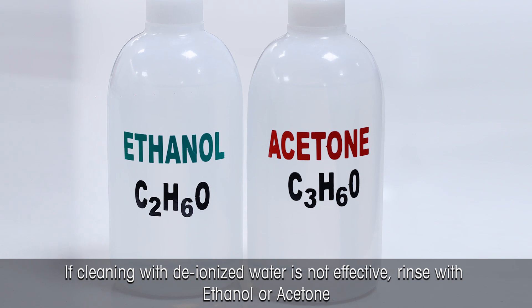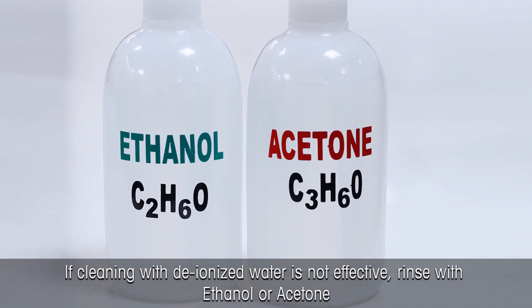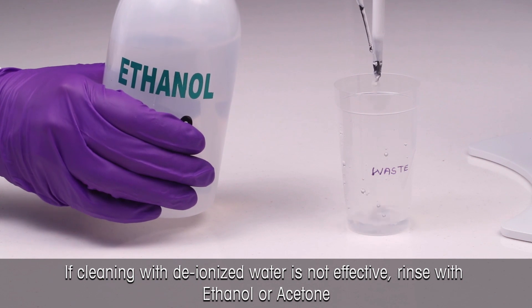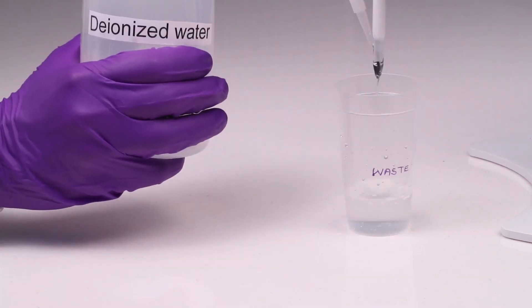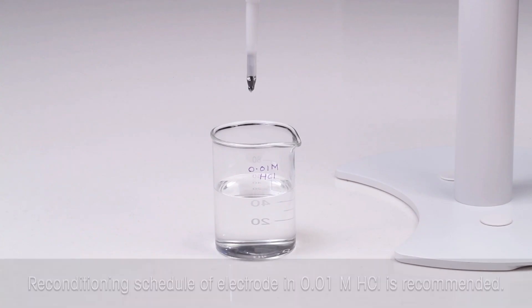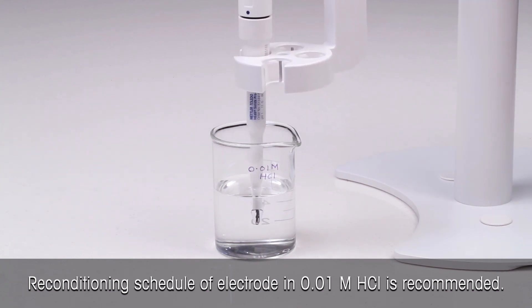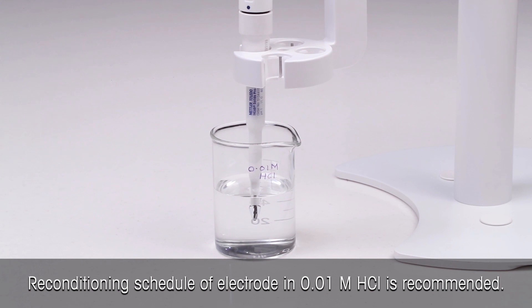Some tips to get accurate and precise results. For thorough cleaning of the sticky residues from the electrode membrane after the measurement, clean it with ethanol, acetone, or a mild soapy solution, and rinse it with deionized water. Regular maintenance is very important for prolonging the lifetime of the pH electrode. Reconditioning of the electrode in 0.01 molar hydrochloric acid solution is recommended.